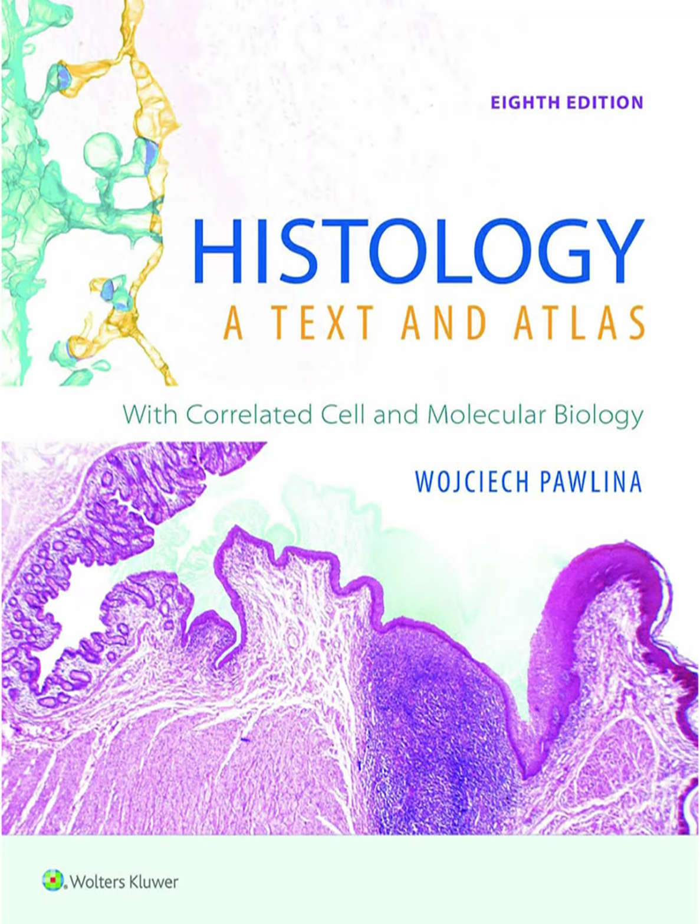They exploit tiny differences in the refractive index, how much light bends as it passes through different parts of the cell. They convert these invisible phase differences into visible differences in brightness or contrast. So you can see structures inside a living cell without staining it. Yes. It's fantastic for observing cell behavior, movement, division. Nomarski optics are particularly good at giving a pseudo-3D, almost bas-relief appearance, highlighting surface textures.